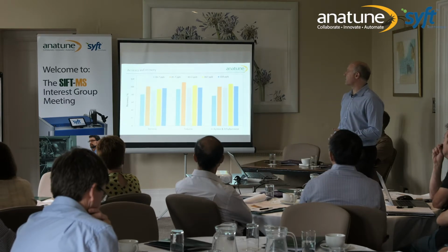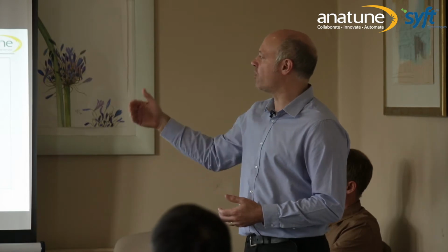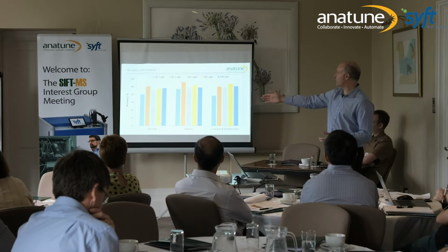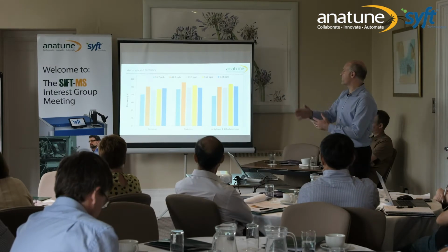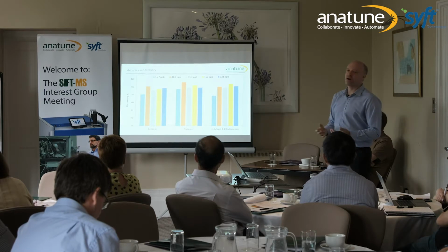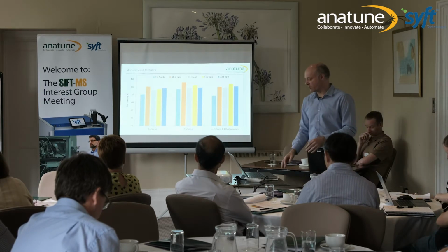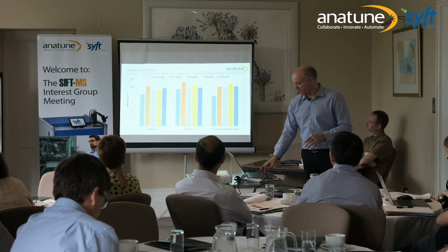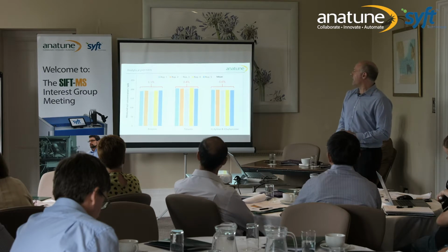This is, again, the recovery now of that accuracy and recovery exercise. So what are we recovering back from our spikes? Again, you can see at the low concentrations, we're slightly under recovering, but in the concentration range we expect, our recoveries are somewhere between 90 and 110%. We fully accept a plus or minus 20% recovery. It's a perfectly acceptable method. And then analytical precision.